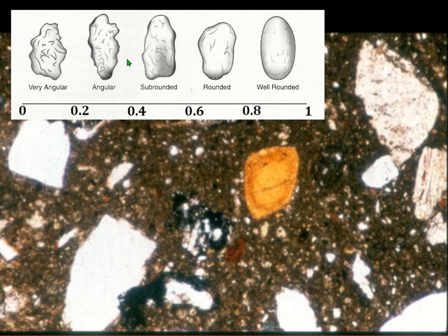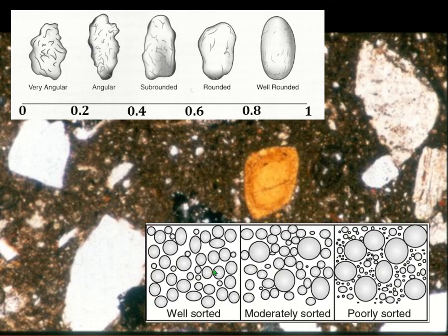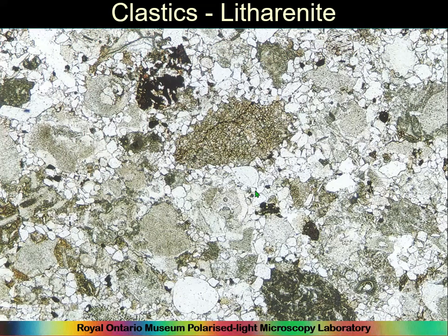But you'll want to describe your sand, and also the sortedness. Is it badly sorted, or is it moderately sorted, or is it well sorted? And so this is how we classify the different sands by the roundedness and sortedness. There's also, what is the sand actually made of, which of course matters a great deal if you're doing petrology of pottery, but actually matters quite a big deal to geologists as well. And they have various types of sandstones based on what is in it.